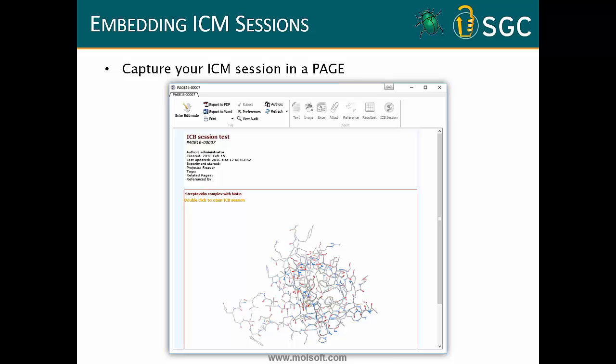In the unstructured data component, which I'll show you in a minute, it is possible to actually have plots such as dose response curves, for example, although I will not be showing that today. So there are ways in which you can visualize the data that's stored in the back-end database. But for the unstructured pages, it's mostly putting in things like images and PDFs and Excel spreadsheets and stuff that's not quite so live from that perspective.